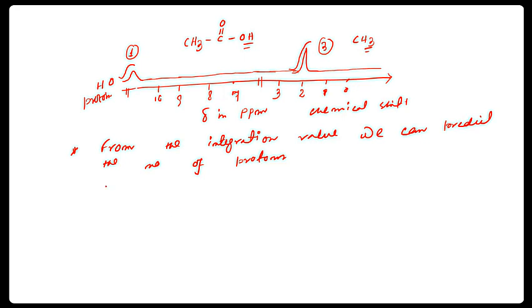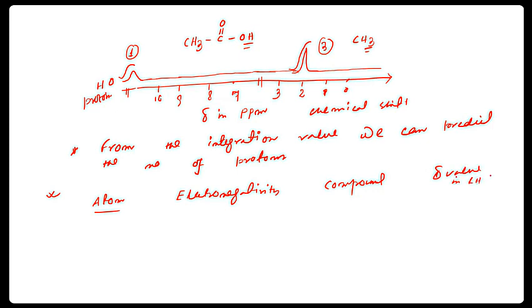Let's say we have some atom and let's check their electronegativity. This part is highly interesting. Think about the compound and its chemical shift, the delta value in 1H NMR.